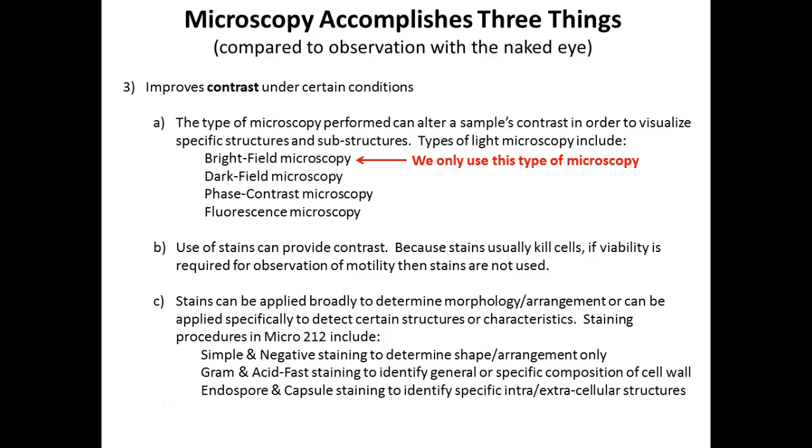Gram stain and acid-fast stains are what we call differential stains, because you get one of two results. You can differentiate one group from another. And these are based on specifics of their cell walls, which is why they will stain differently in this procedure. And also why we'll use two colored dyes to help us differentiate the two different groups.